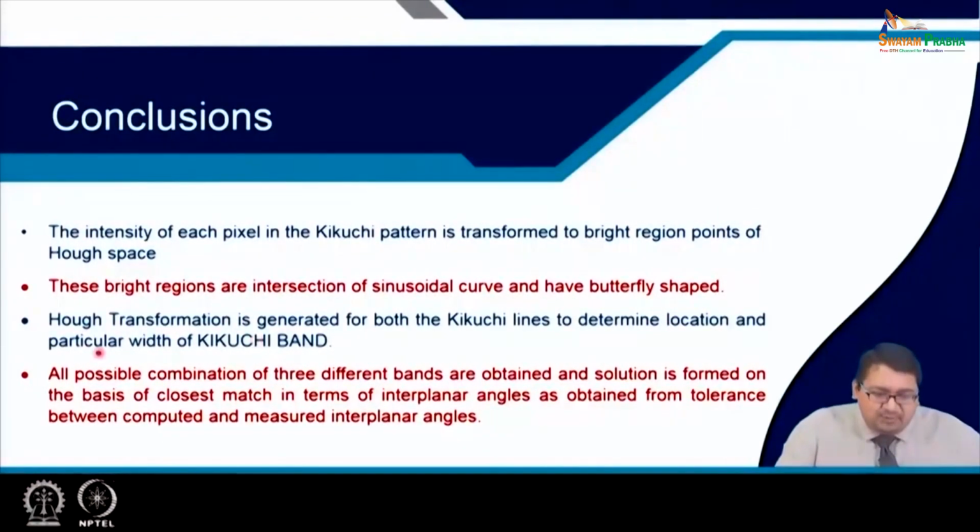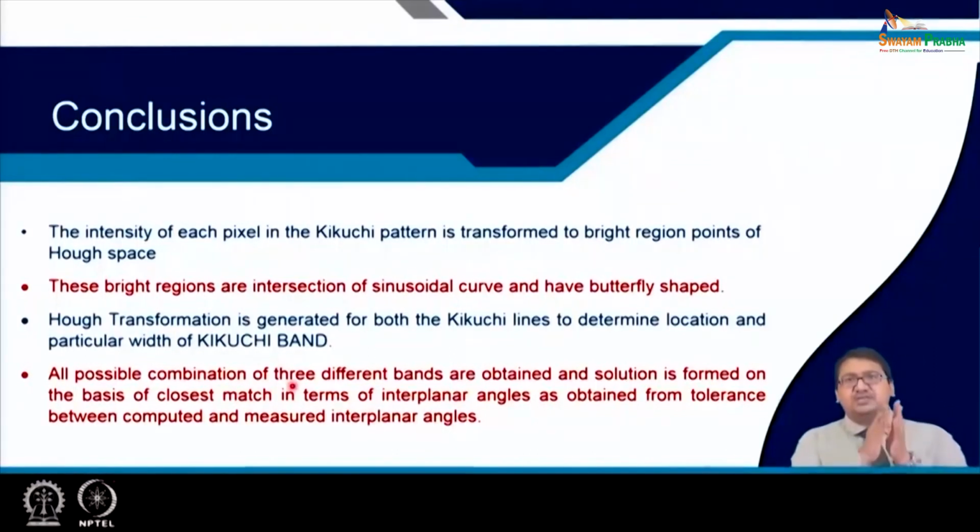Then all possible combinations of the three different bands are obtained and the solution is formed on the basis of the closest match in terms of the interplanar angle as obtained from the tolerance between the computed and the measured interplanar angles.